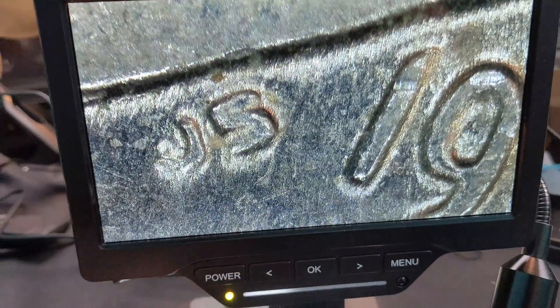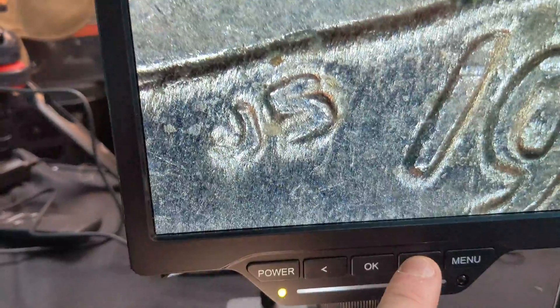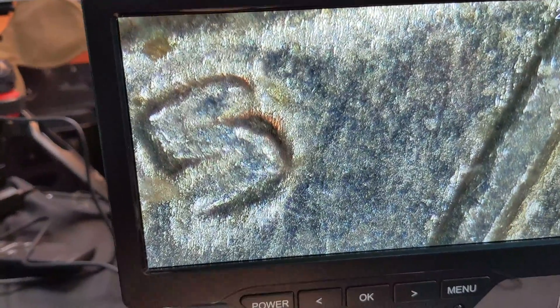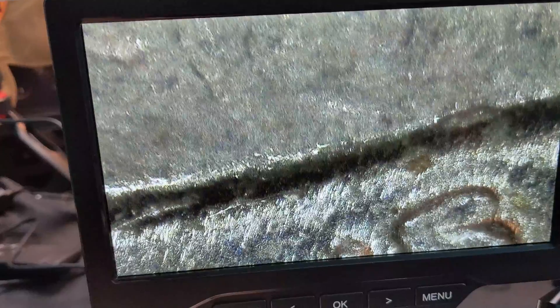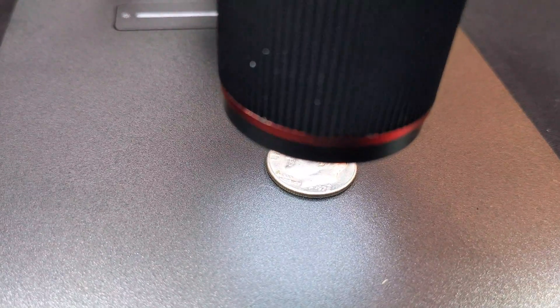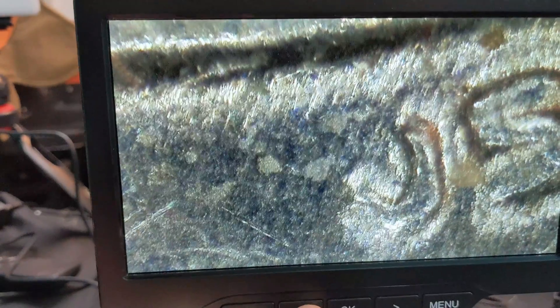Look at that detail, guys. We can press the OK button and it takes a picture. Once you've got the details set, you can zoom in even more — and is that not incredible? Look how far you can go in. You can see everything. Look at this — that's a dime right there, zoomed in that far.